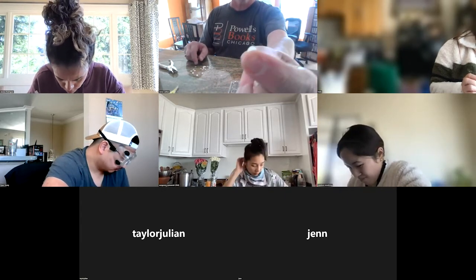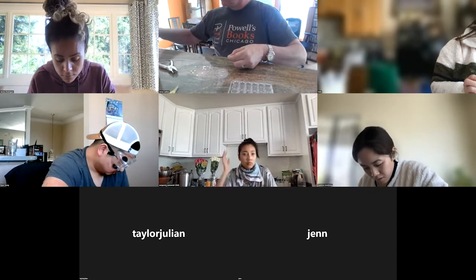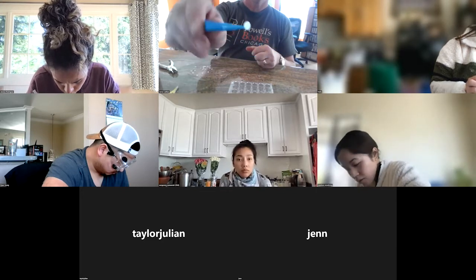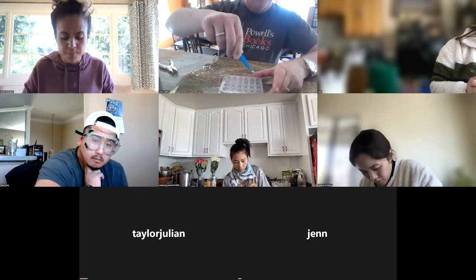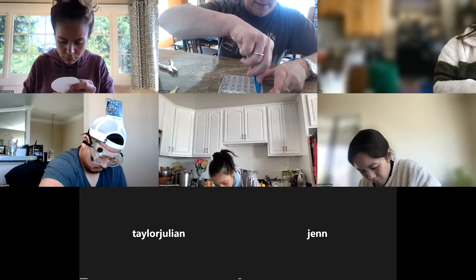So if you do the 2-hole punch, they're all going to be about this big, pretty small. So you take them with the pair of forceps. You push it down to the bottom. You want to make sure it's completely soaked in.